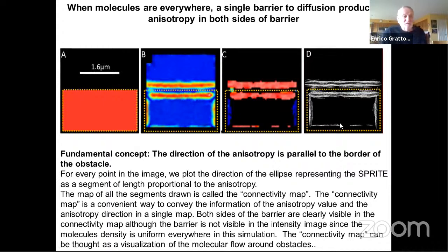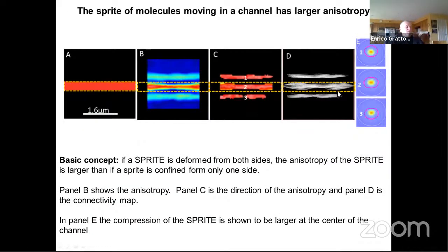Simply cannot cross because of the construction I have. So this color, so the deformation and the color of the deformation will give me the direction of the motion. So suppose I have a channel, in which particles can move and the other parts too. I will have three parts.